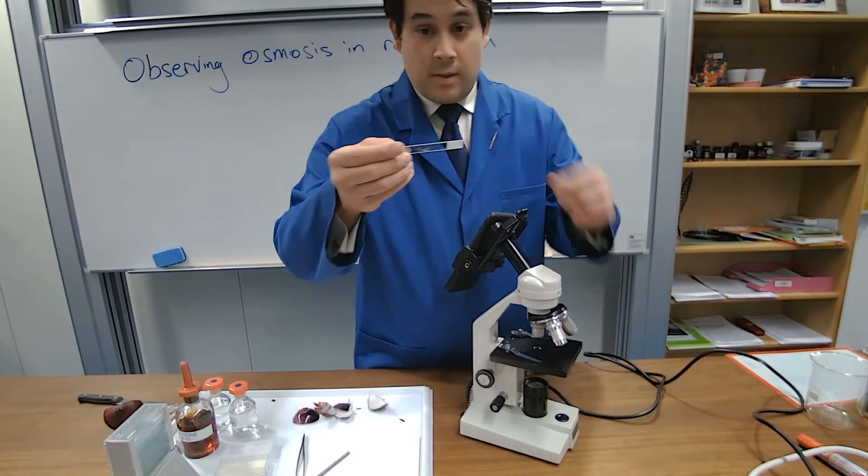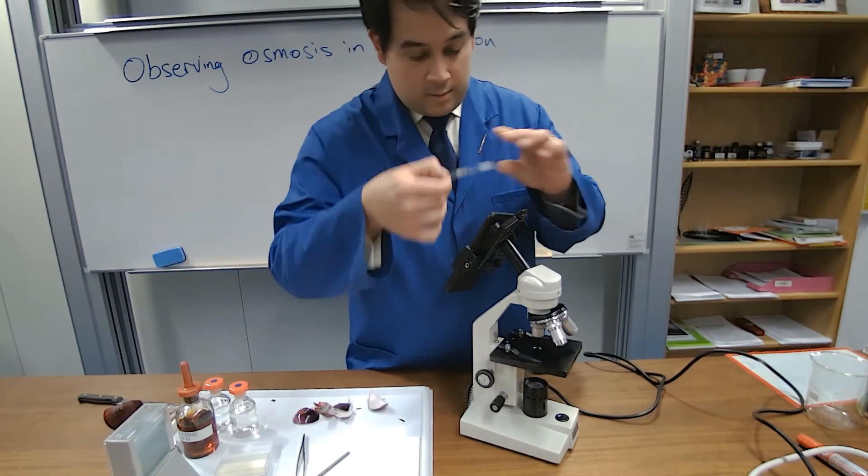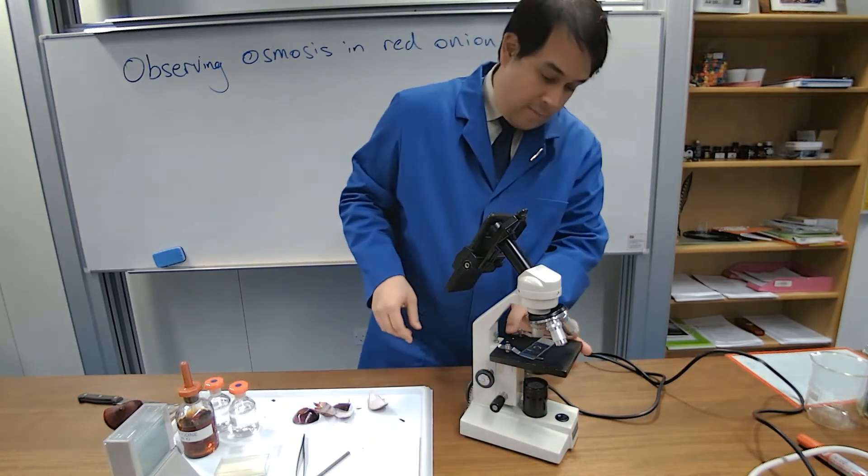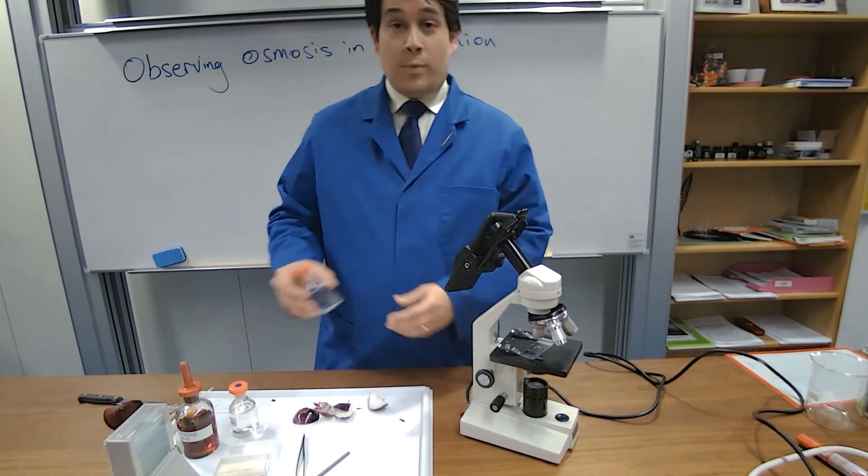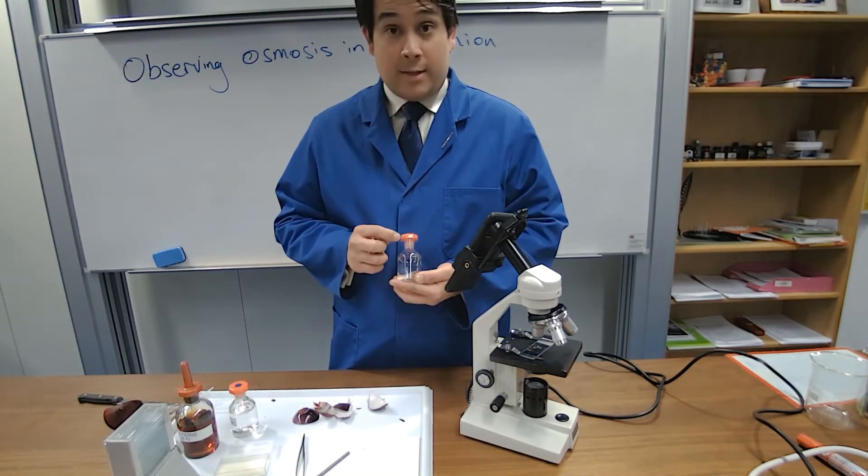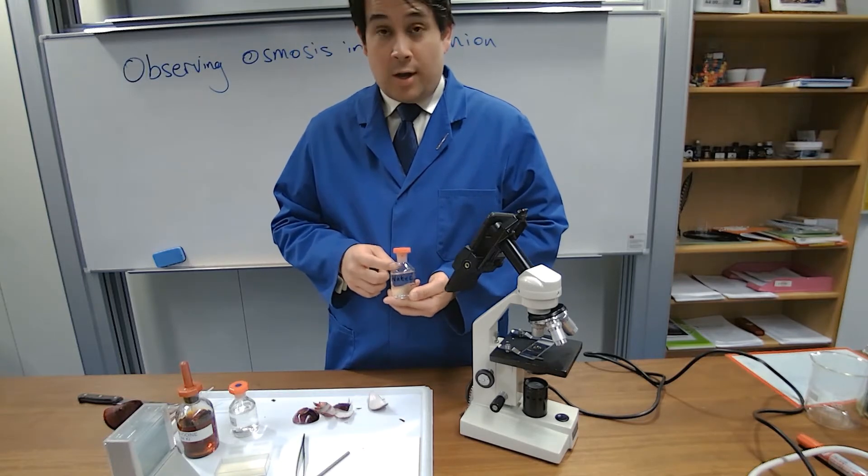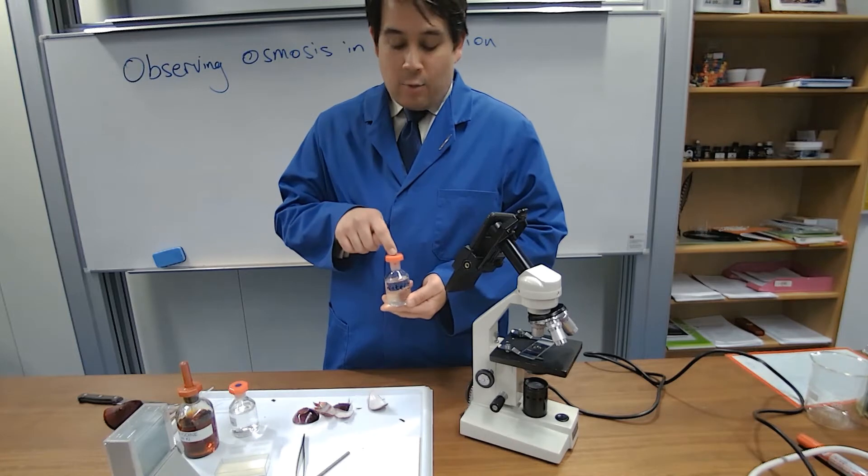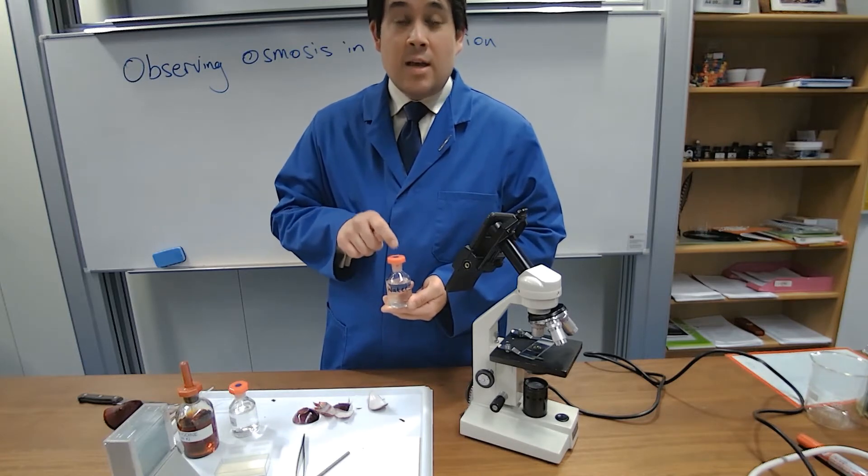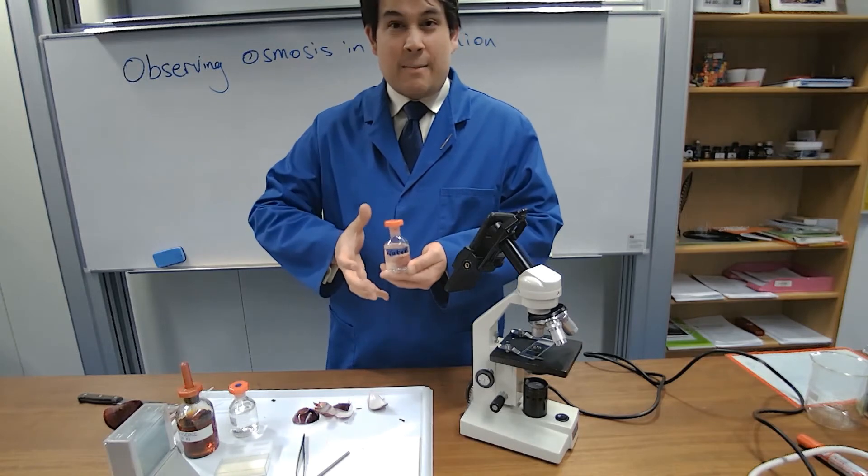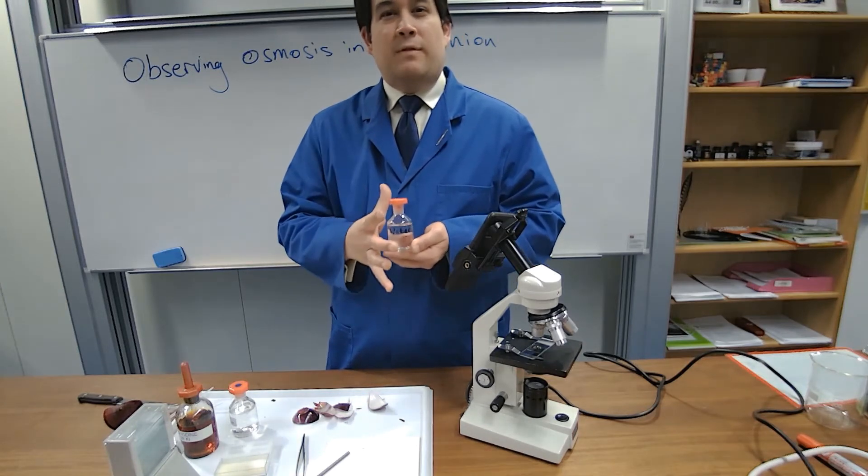We're going to put this prepared onion specimen onto the light microscope and then find a bit of the red region. Then we're going to add a bit of distilled water. Now remember, distilled water is hypotonic, therefore it has a very high water potential. If it has a high water potential, by osmosis it should move into the red onion cells, making them fully turgent. So the cell membrane should be full.